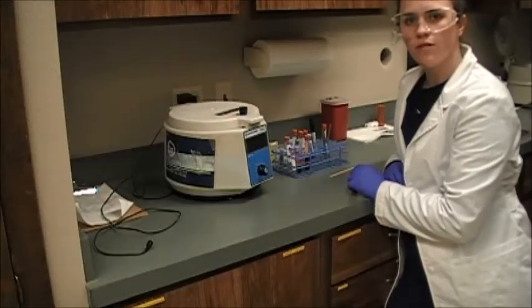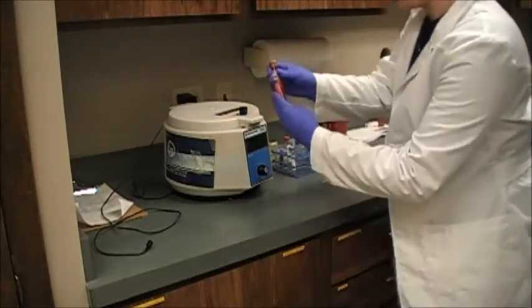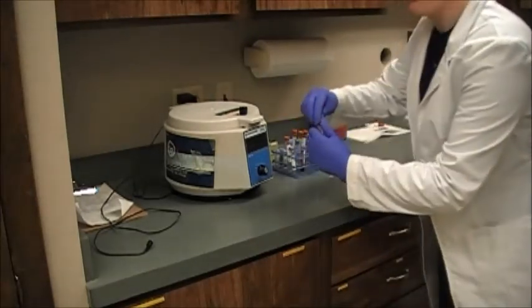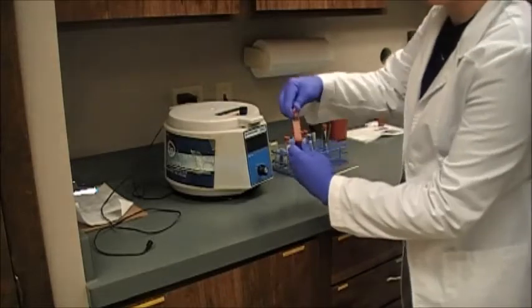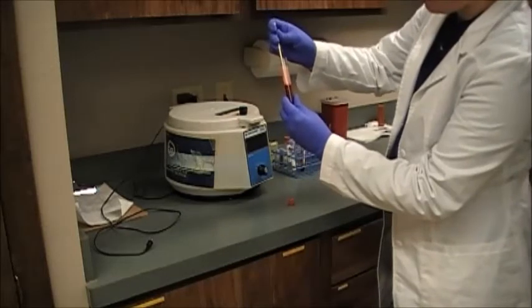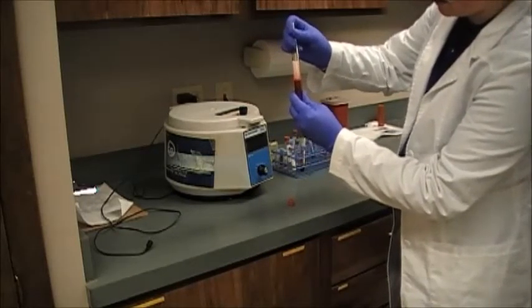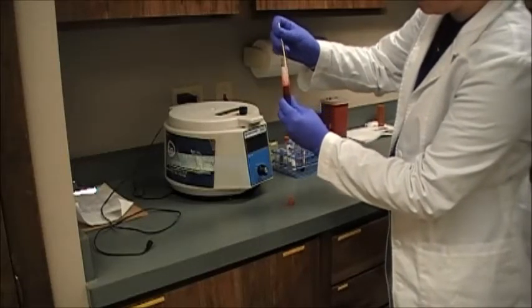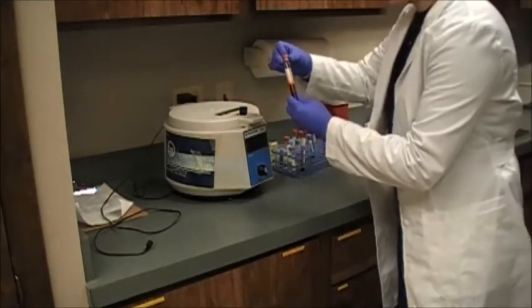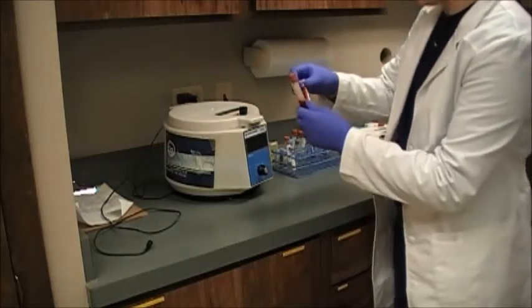Our blood tubes have been clotting for about 20 minutes now. You can kind of see what they look like — there's definitely a clot in here. Before I centrifuge it, I'm going to take the lid off of my red top tube and gently rim the clot on the inside, just breaking it up from the edge of the tube so that it'll spin down and separate. I only need to do this in the red top — not in the EDTA tube because it's an anticoagulant and it's not going to get a clot in it.